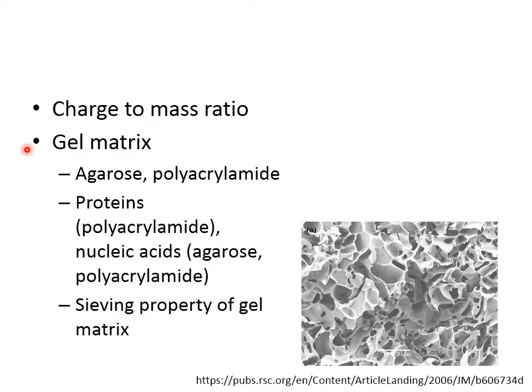Those molecules which are smaller can easily move through the channels of the gel and their migration rate will be more, as compared to the molecules which are larger in size, for which it would be difficult to migrate through the pores of the gel. So the migration rate of the large molecules would be relatively less. Based upon this difference in the migration rate, separation of these molecules will be done.